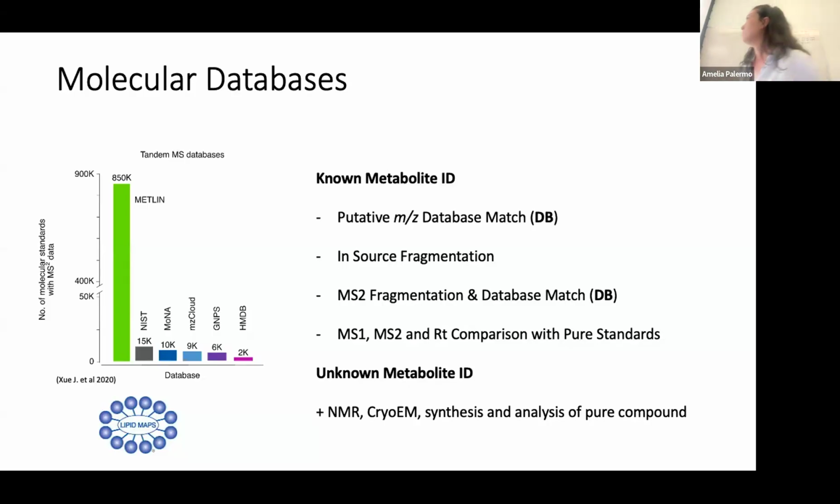So I would say this part is not time consuming. In source fragmentation, there are tools that allow to integrate that too in this first step, so not time consuming. This one, there are several options, is slightly more time consuming, but still accessible. When it comes to this and this part, it can be from months to years, depending on the molecule.